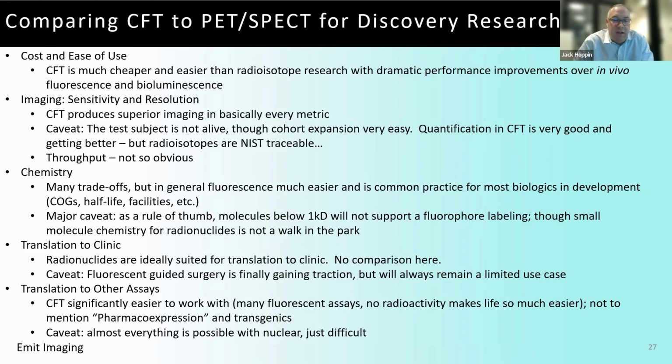I think we're excited to use CFT to answer questions that can be harder to answer with radioactivity. So as a first bullet, cost and ease of use, CFT is just simply much cheaper and easier than radioisotope research, and it is dramatically superior to in vivo fluorescence and bioluminescence. Now, people have infrastructure, but it's just a lot easier to work with the fluorophore.